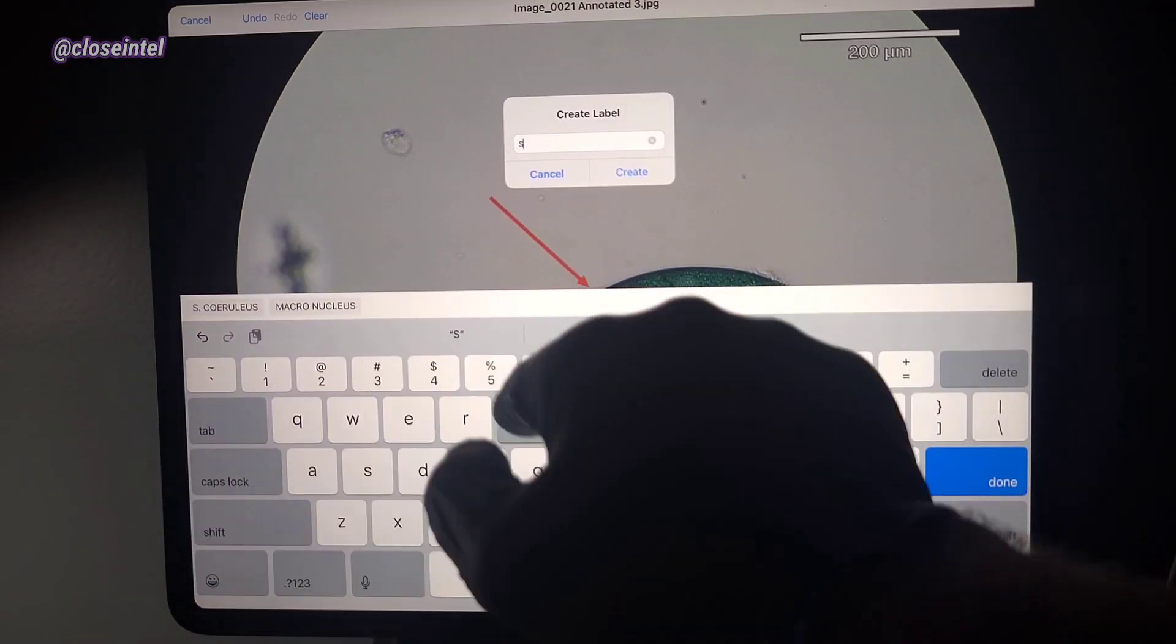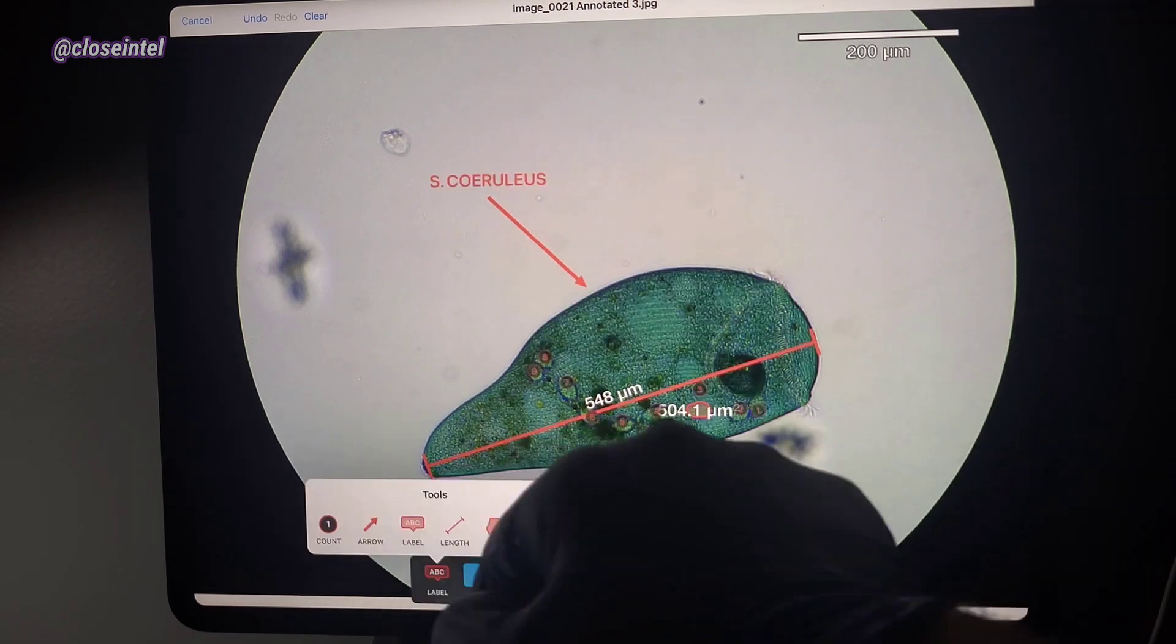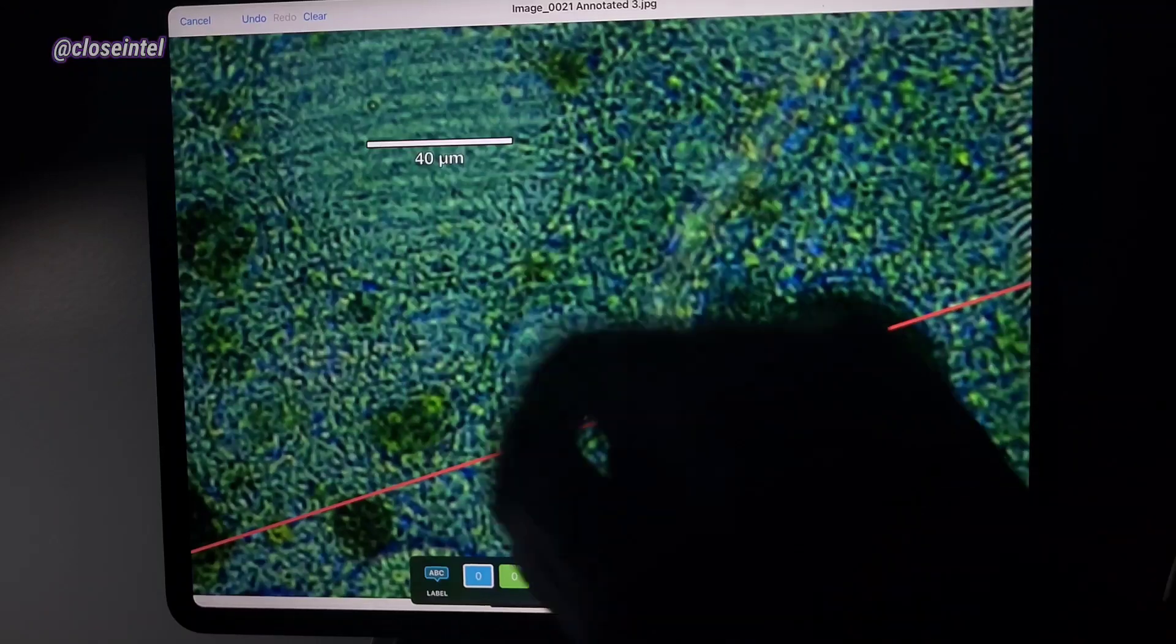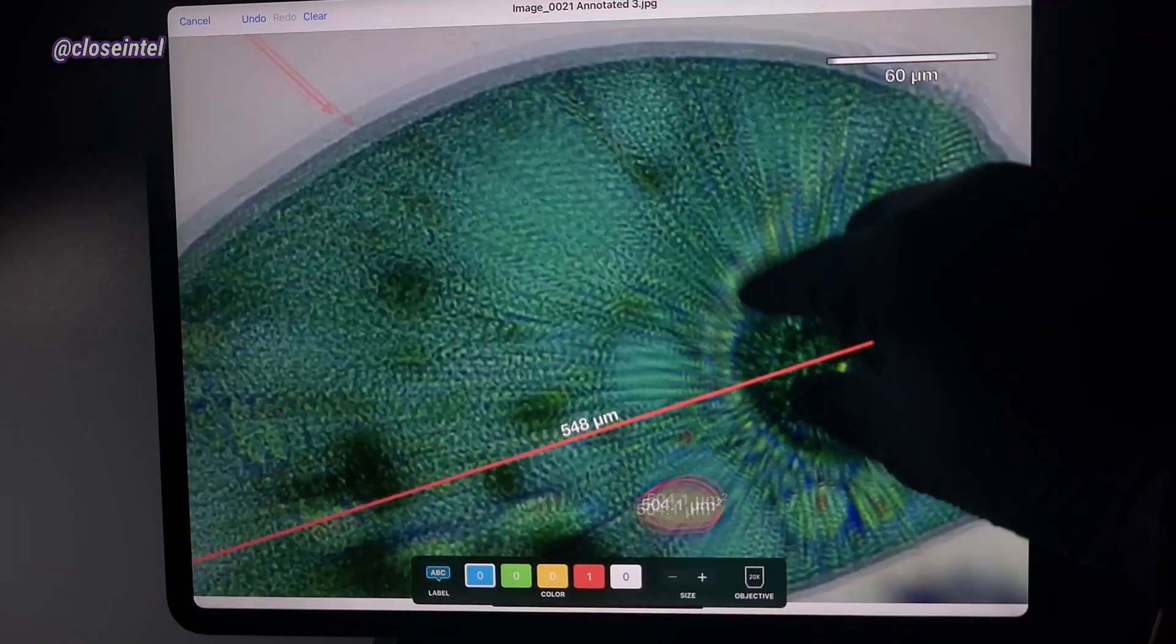It also has nine macronuclei which take up an area of about 500 microns each. I also noticed the scale bar actually scales with the image as you zoom in on them which I thought was pretty cool.